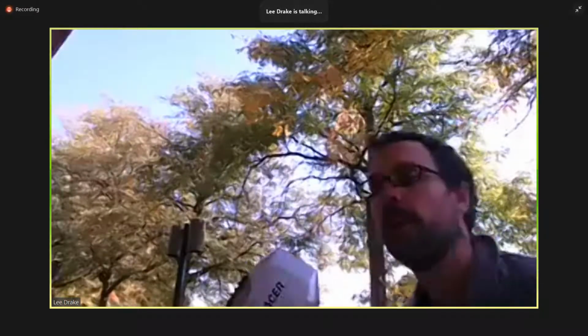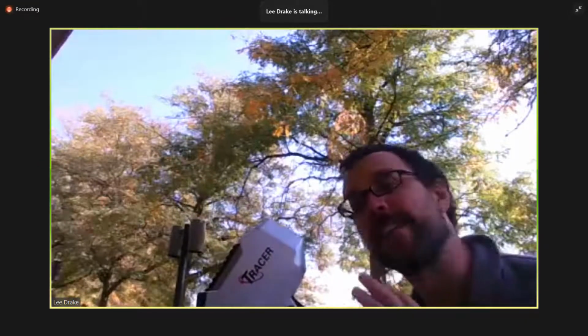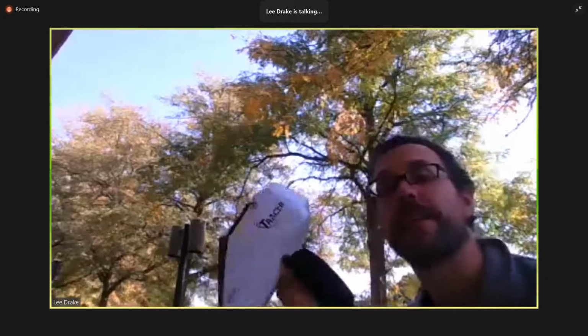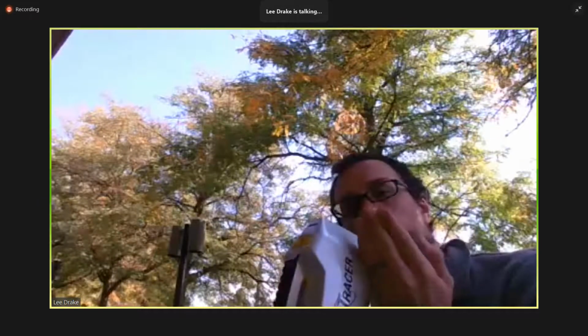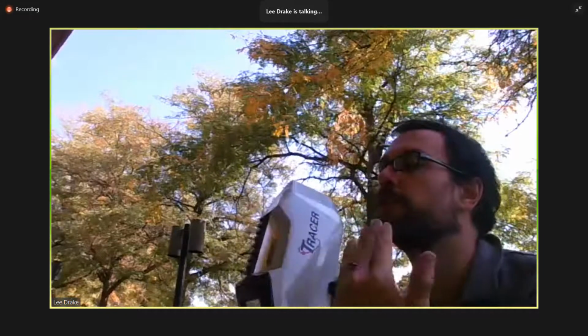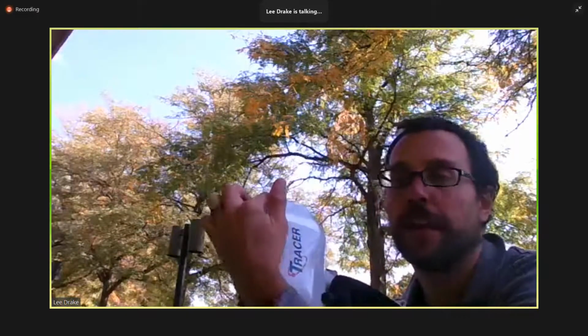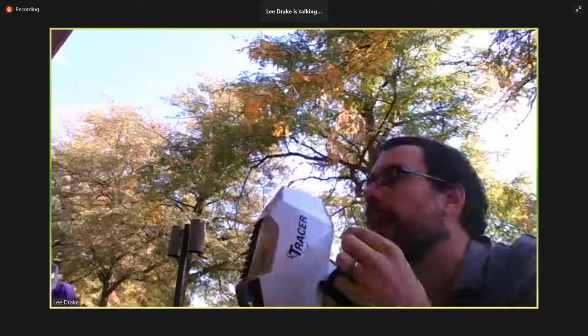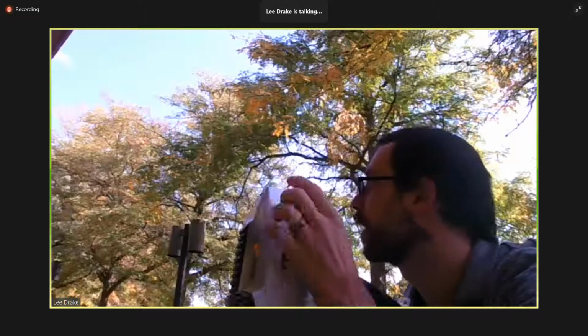Now for XRF, the one complication we have is all three of these steps, photon source, interaction, and detector, have to be handled in the same object, which is what makes handheld XRF so incredible. The way this works is we use geometry. Inside the instrument that I'm holding right now, we have an X-ray tube, which is angled right alongside where my hand is, and then we have a detector right here. So we make a triangle, and the triangle has a focal point right on the surface here.